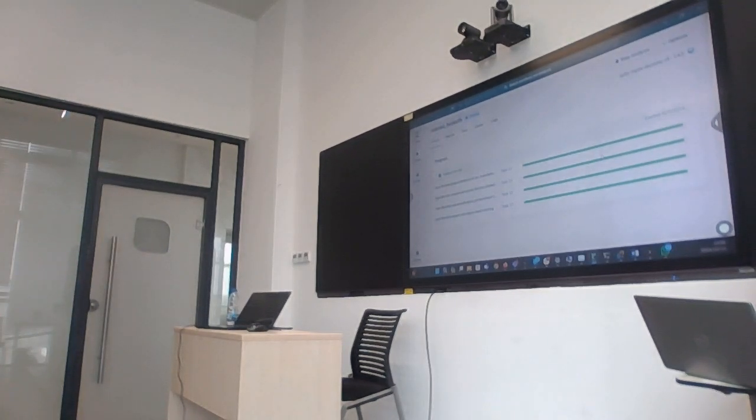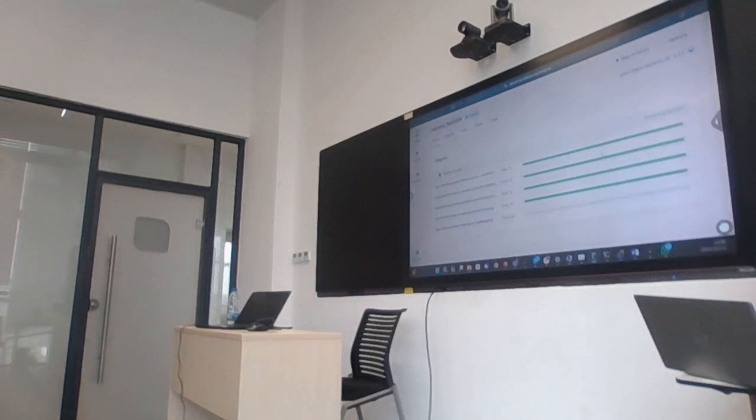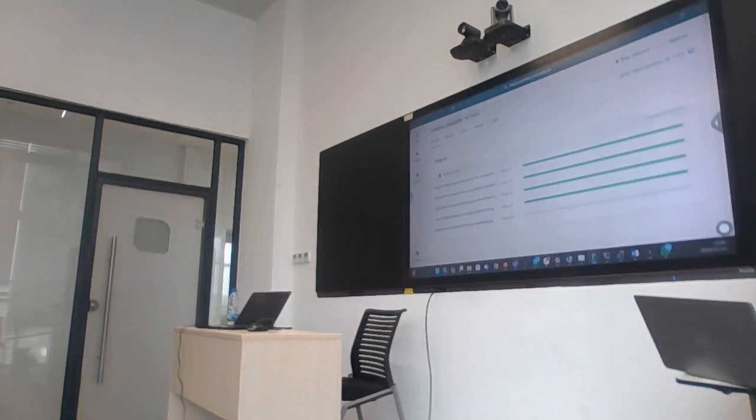This tool, which is called hostile, doesn't just mean that this tool wants to fight with you. It's called hostile because it's for removing the host. If you need to remove any human reads, then you need to have a copy of the human genome to compare against. That's why we preloaded it onto our computers this morning. So if you go home and you've got a different computer, if you want to save bandwidth, preload the hostile data onto your computer.